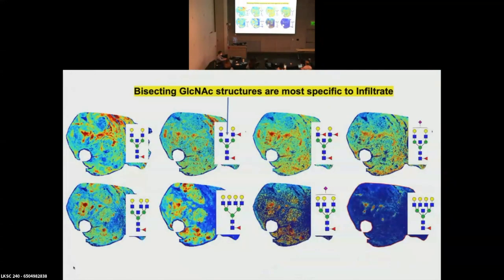And again, we can start mapping it. Now, some of these glycans have other functions, but underneath them is exactly where these immune clusters are. And there's a theme about bisecting and high mannose glycans, which we now know from PBMCs or B cells, which I'm not showing right now, but that's what most of these are from other methods in that cluster I just showed you.